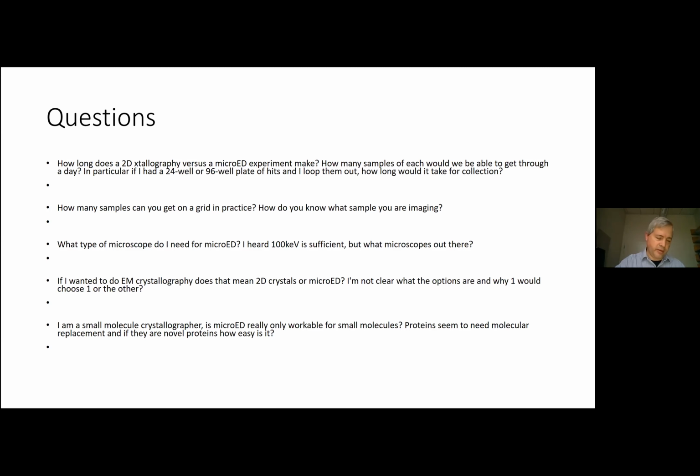However, I think recently Google had this great breakthrough with AlphaFold, where they could calculate the 3D structure of small proteins de novo. And so potentially, if that really works, it may not be perfect, but it might give you something good enough, if it's a small enough protein that AlphaFold works for it. Perhaps you could use that to get an initial model if you don't have any molecular replacement model.